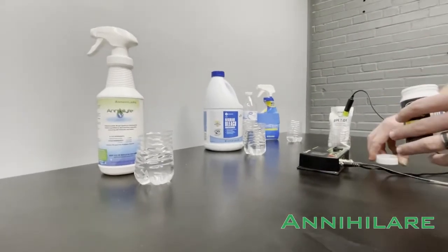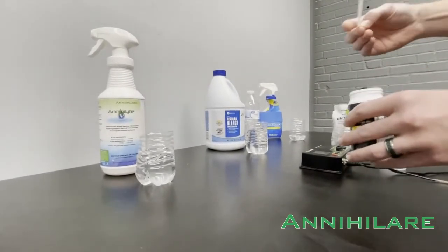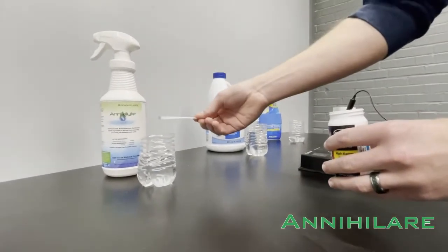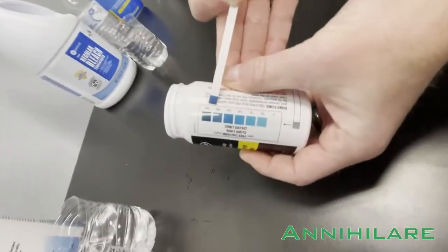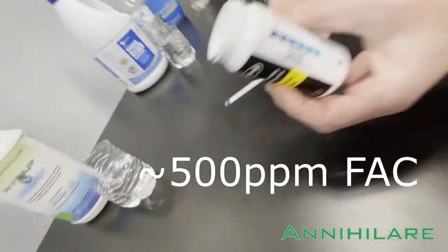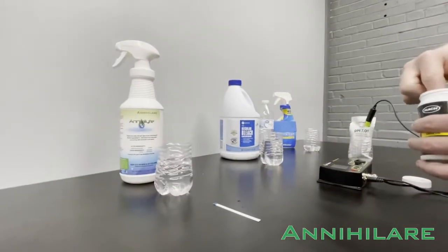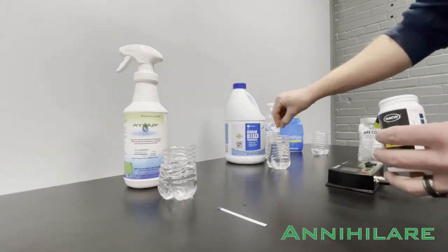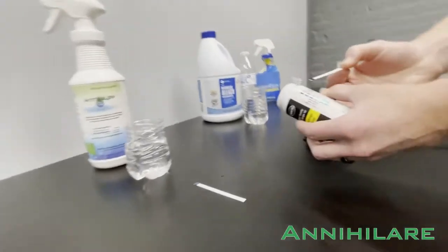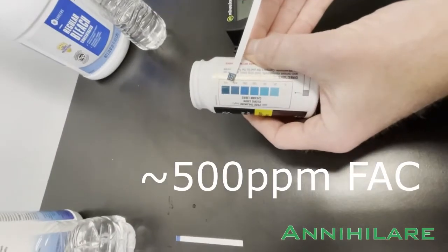So I'm going to start with the hypochlorous acid solution. If you can see here compared to the color, it's around five or six hundred parts per million, nice blue color. And I'm going to do that with the sodium hypochlorite diluted solution here. You can see we're roughly the same parts per million.